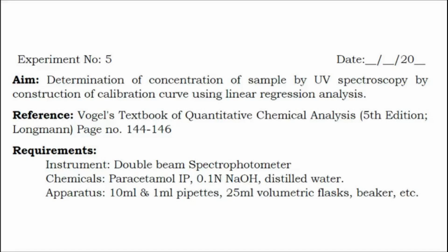What we do generally, we prepare different dilutions of the pure substance. Those dilutions will give you certain values of absorbances. Okay, so once we have absorbance value for those concentration, we can plot a graph. The graph will be on x-axis, it will be concentration. We may have different concentration like 2, 4, 6, 8 and 10. For every concentration value, we will get one absorbance value.